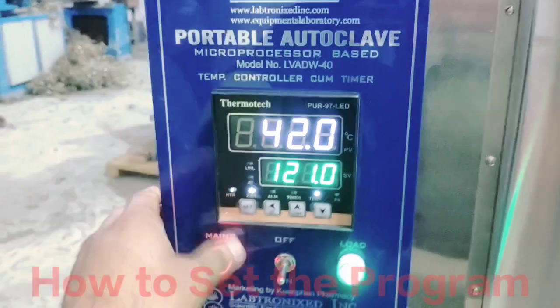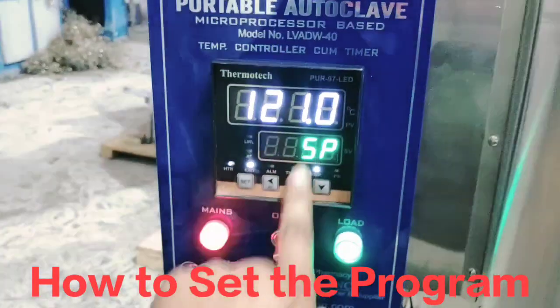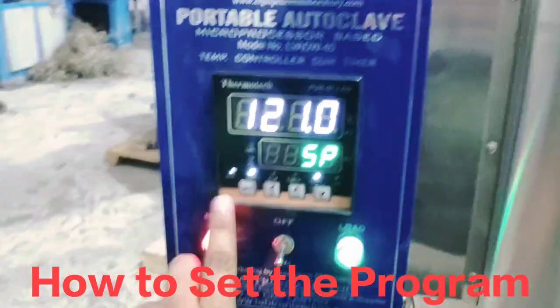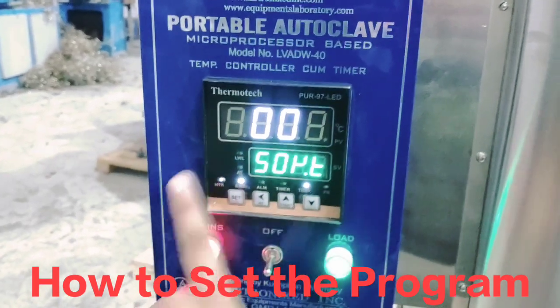I will tell you one more time — a second time. Again I will set the set button. We can change the temperature, then we set the sterilizing timing, like 2 minutes, 3 minutes — you can set it.